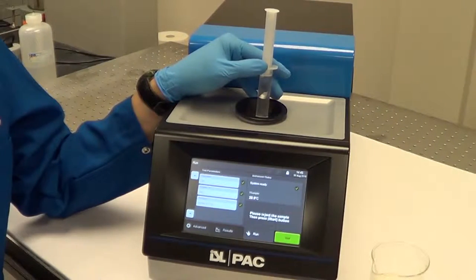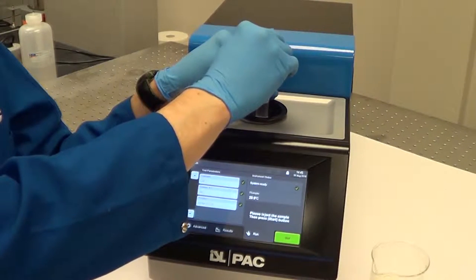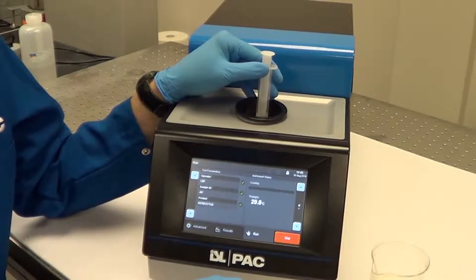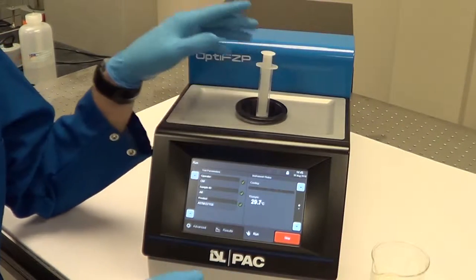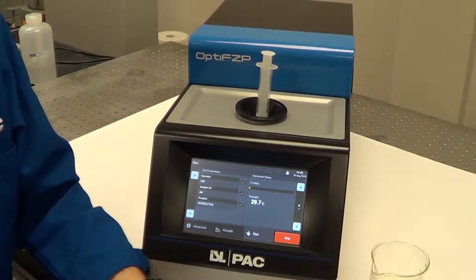Alright, and for completion of a test, we're going to inject a new sample. We're going to press start. And this time we're going to let it run. And in approximately 15 minutes or so, we'll have our number. Once it's completed, I'll show you the results menu.